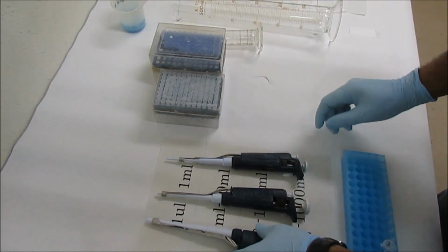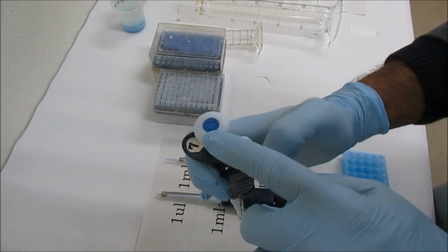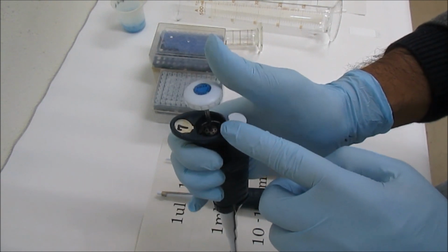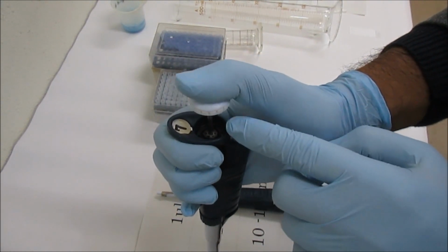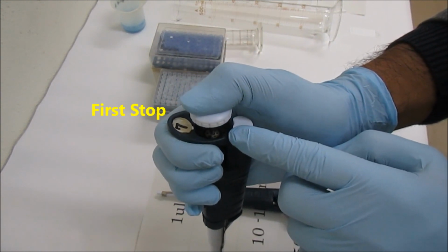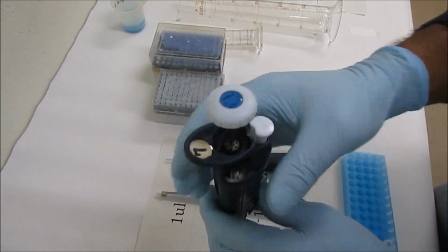Now I'm going to show you the parts of the pipette. This is the plunger, which just moves up and down. It has two stops: this is the first stop and this is the second stop. Later I'm going to tell you where we use the first stop and the second stop.